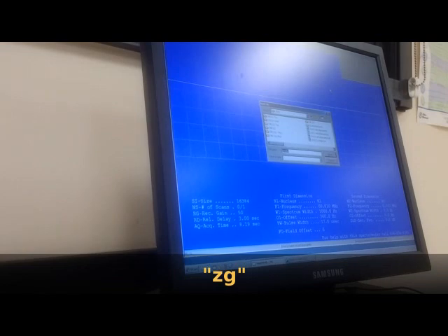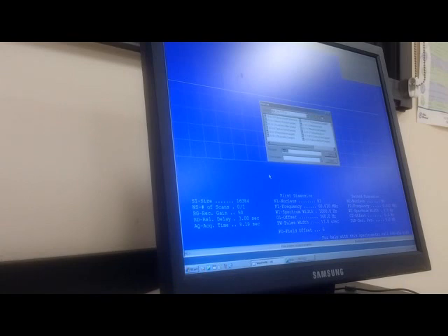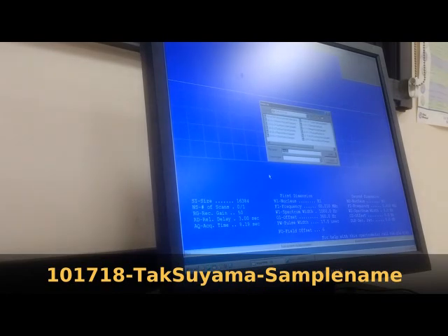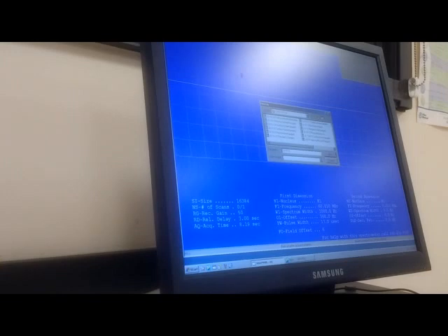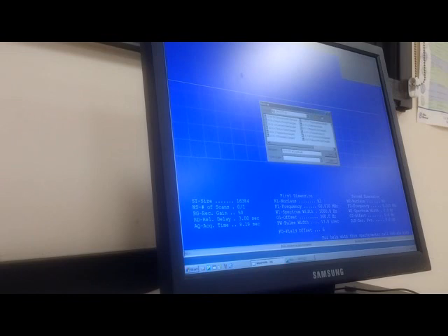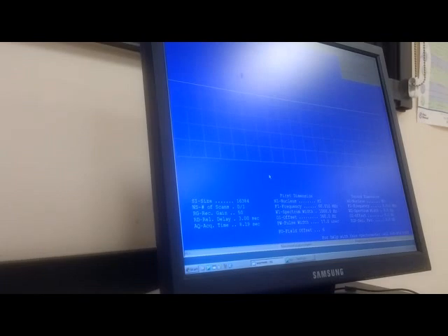Type ZG and hit enter. And you will want to find a folder that belongs to your lab. If you're in the Tuesday Chem 211, you can go here. And then type in a sample name. Now you want to start with the date, and then your name, and then the sample name. So in this case, I'll say 10, 17, 18, Tak, Suyama, and then ethyl benzene. Hit enter. That way that will start the acquisition. Now after the acquisition is done, you want to go to NMRNuts to see where the chemical shift is.